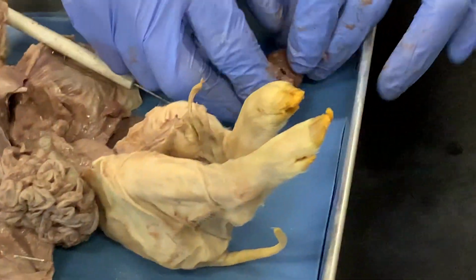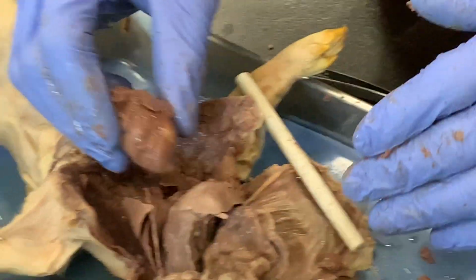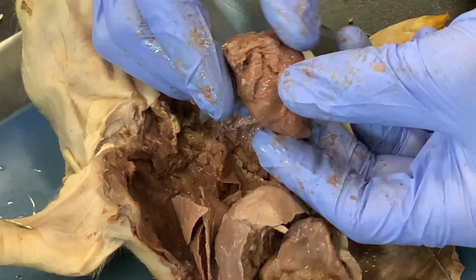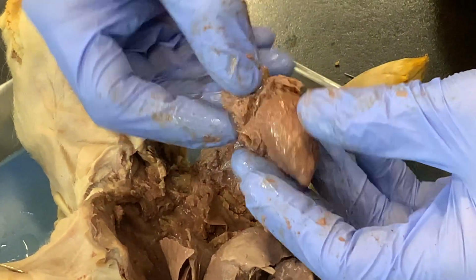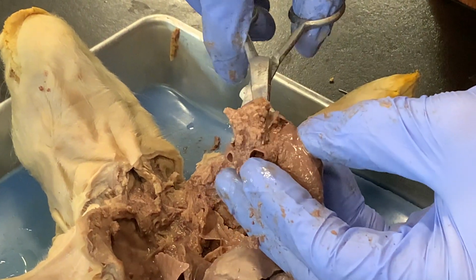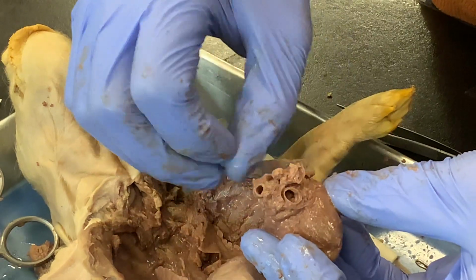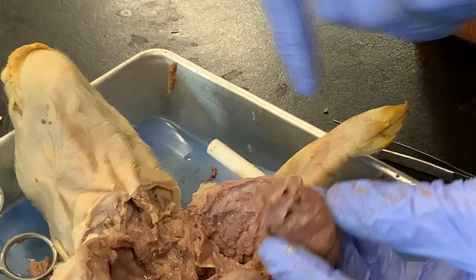And so here we have the ventral view again. So this is the position that it was in the body cavity. This is the anterior end and the posterior end of the heart. And if we rotate it around and look at the dorsal side, here is a small piece of lung tissue, which I will remove so that we can see the blood vessels more easily. And there are some large blood vessels on one side here that we will talk about, and some other large blood vessels on this side as well.